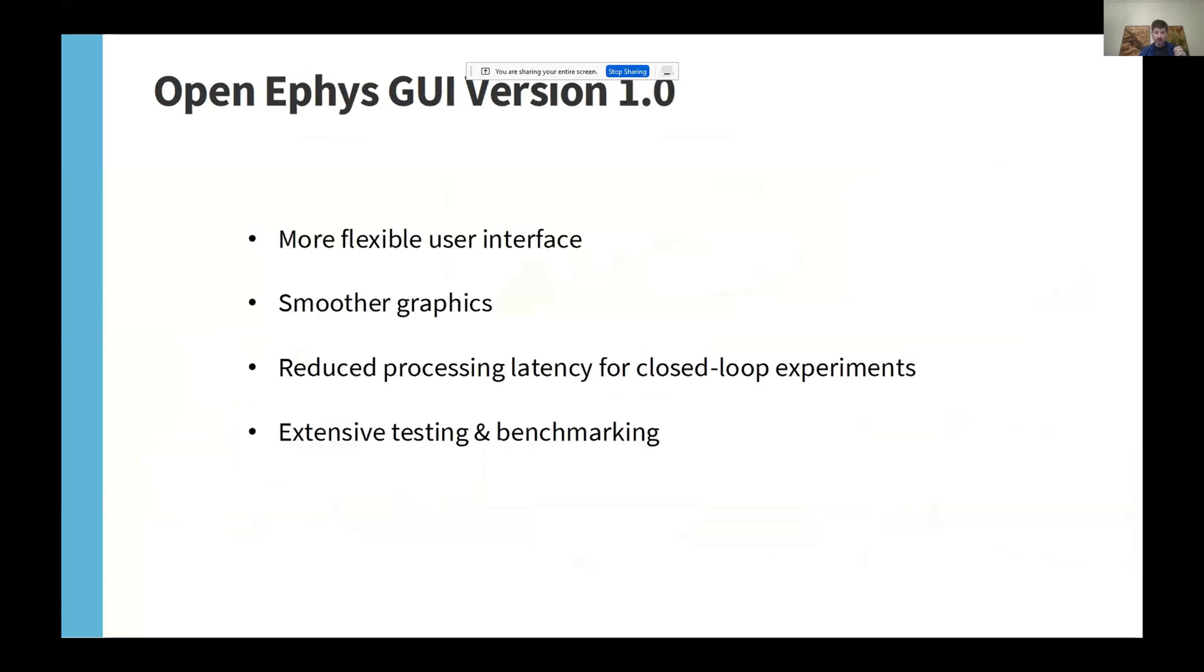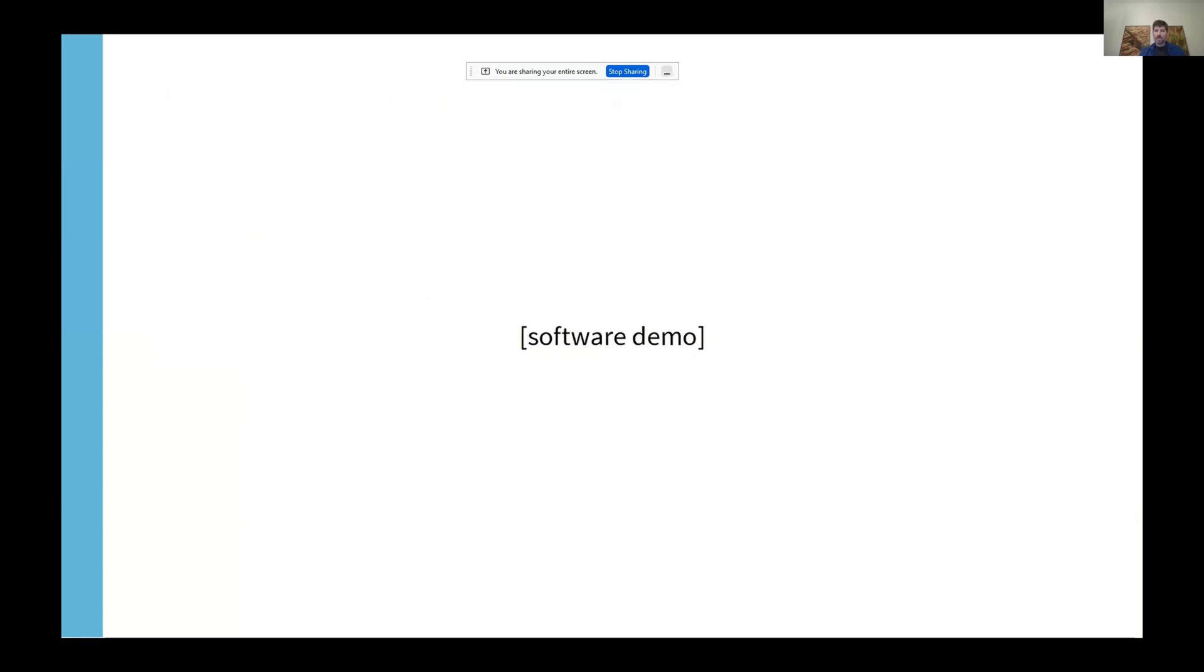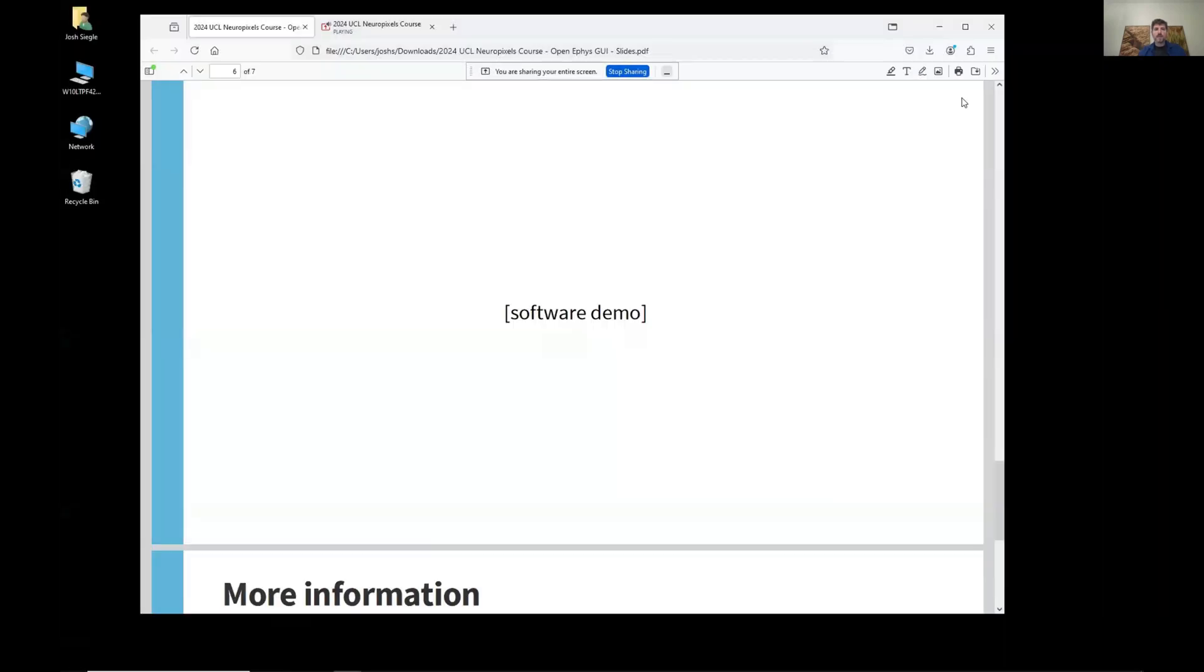We're currently putting finishing touches on version 1.0 of the OpenEFIS GUI. It includes a wide range of upgrades, such as more flexible user interface, smoother graphics, and reduced processing latency for closed-loop experiments. But most importantly, we now have an extensive set of tests and benchmarks that allow us to thoroughly validate the software, no matter what combination of plugins are being used. I will now give a demo of this version.